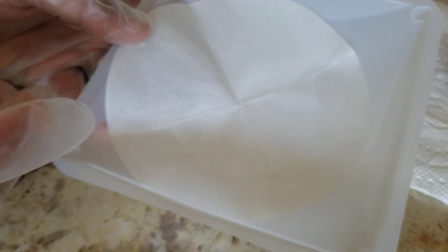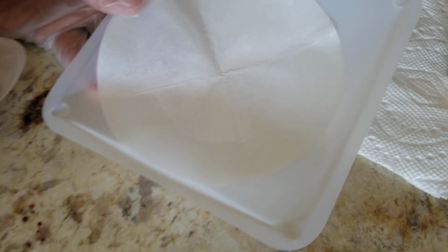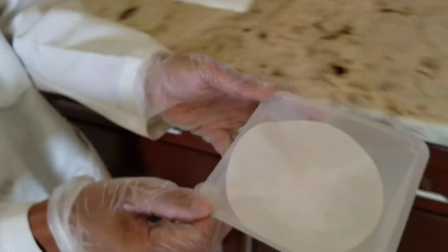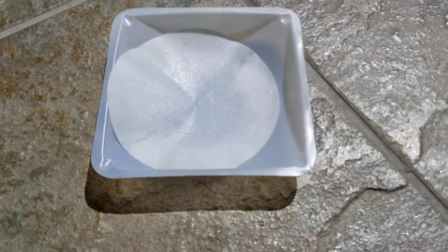Okay, so again, on video it's harder to see because of the different contrast, but there is a layer, almost like a powdery layer, some solid powder that's now on the surface of our filter paper. It's white and kind of milky in color and consistency. But what I'm going to do is take this outside now. So here, we're going to take it and expose it to the sun. I will give it some time.